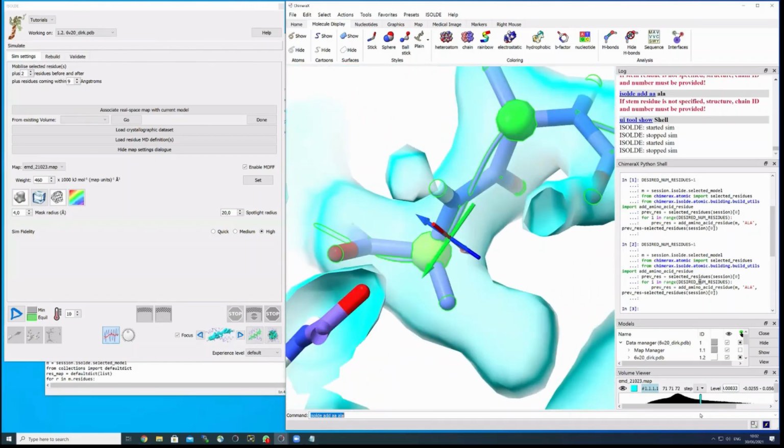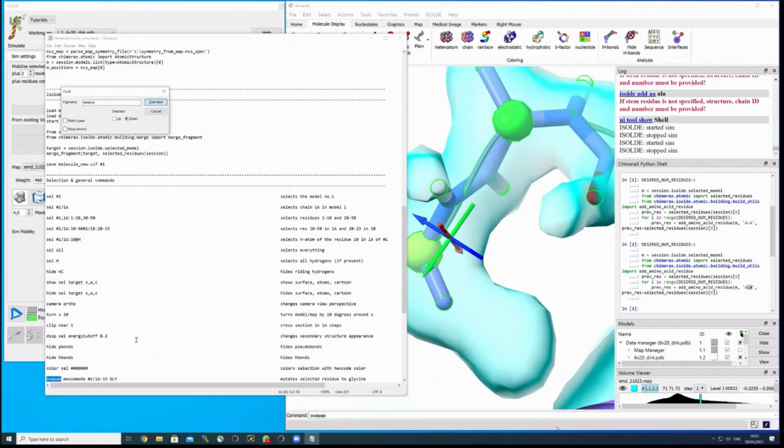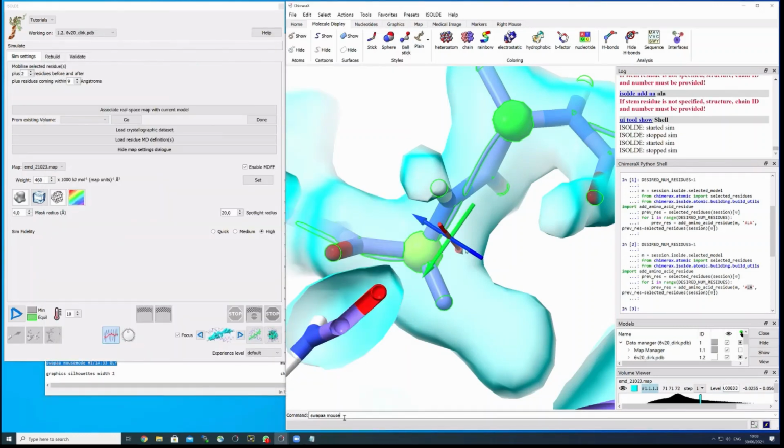Okay. And then one last thing that I would like to show now, and you can of course type already the correct residue here, which is the smartest way to do it, but you can also change residues on the fly. And this is swap AA, I guess. Yes. So the command is here, swap AA for swap amino acid. And then mouse mode, swap AA space mouse mode, hashtag for the model ID. In this case, it's 1 or 1.2 to be more specific.